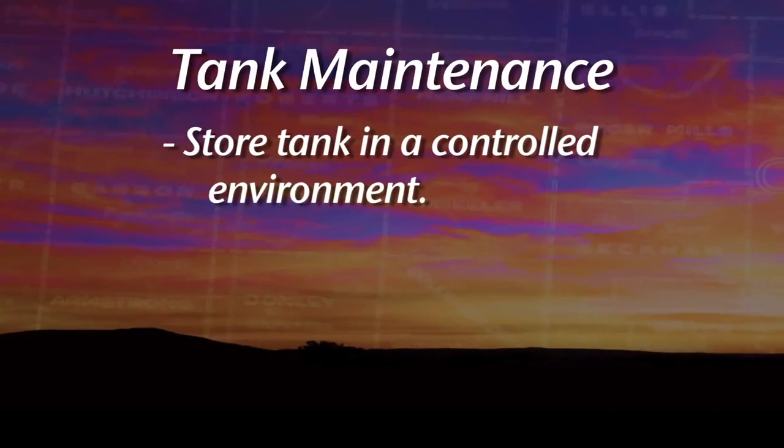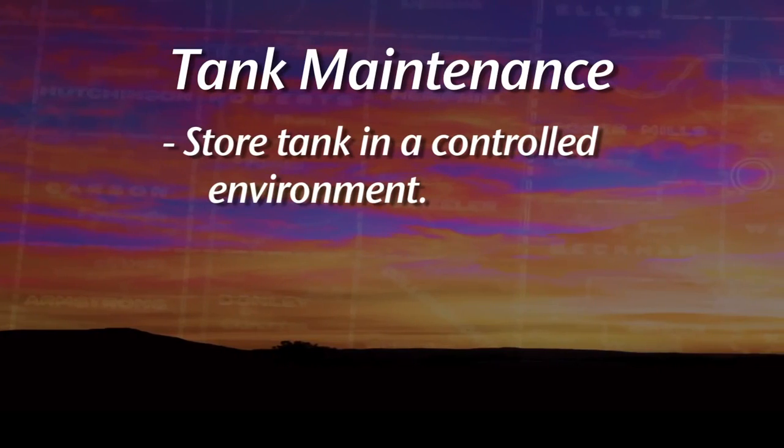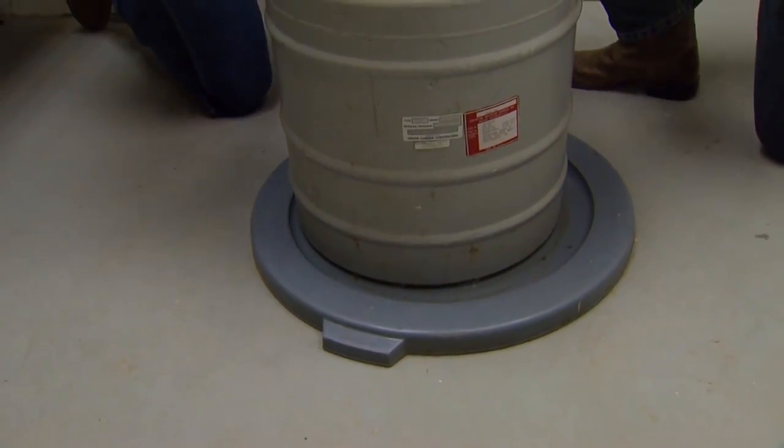Okay, well, let's start talking about maintenance on this tank. You say you've had one of these for quite a few years now that you're still using and it's just fine. Yes, I started AIing back in the early 70s, and I bought a used tank when I first started. It's still fine. So what kind of maintenance do you do on the tank? Well, one of the first things you notice here at the OSU dairy, in the storage room where this is kept, it's a concrete floor, and you notice we have just a trash can lid here, just to keep it up off the floor.